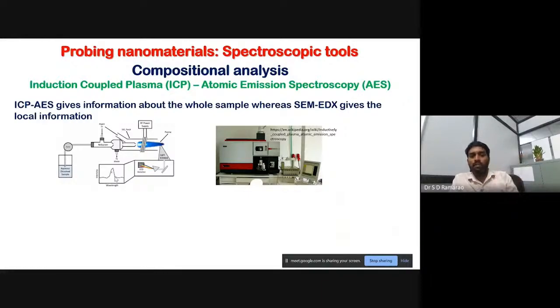Let us say if you take copper, when you excite and de-excite, it will emit some wavelength. When you take another element, you excite and de-excite, it will give another wavelength. They never coincide with each other, but there is some possibility. So that is the different part. Okay, but in general, these wavelengths are characteristics or the fingerprints for given, selected atoms. So that's why whatever information you get is more accurate and more uniform.